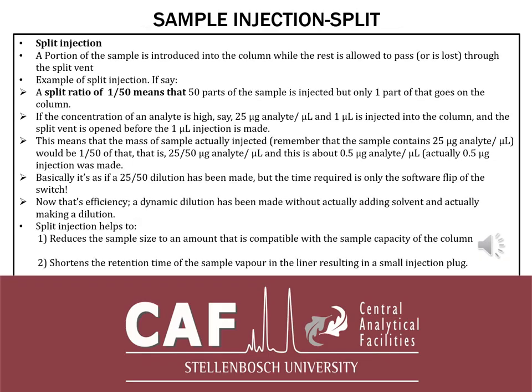Now with a split injection, a portion of the sample is introduced into the column while the rest is allowed to pass or is lost through the split vent. An example of injection, in fact, before we go to the example, a split injection is an electronic way of diluting a sample.